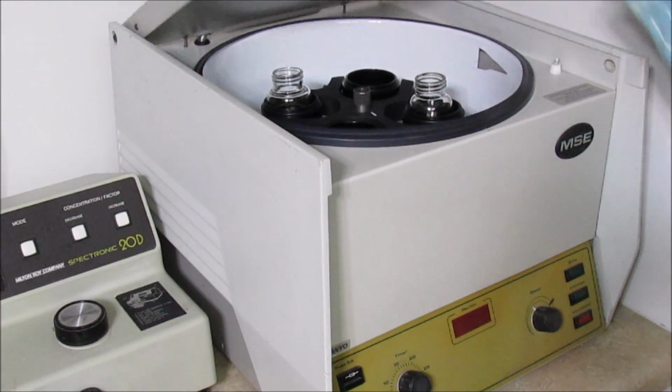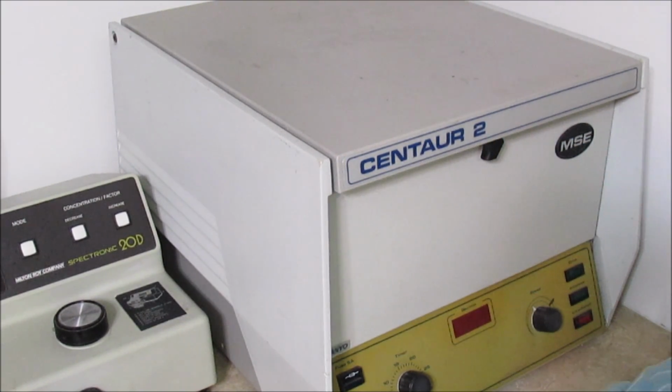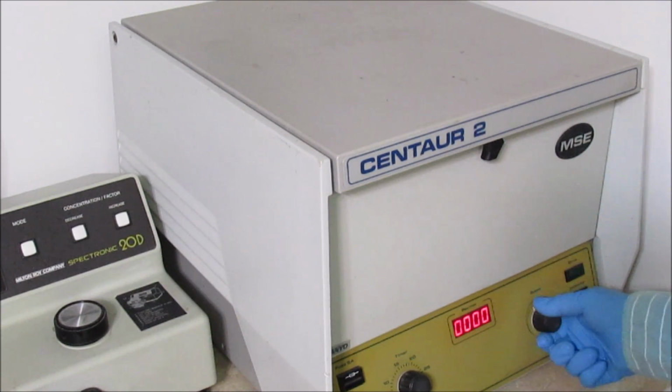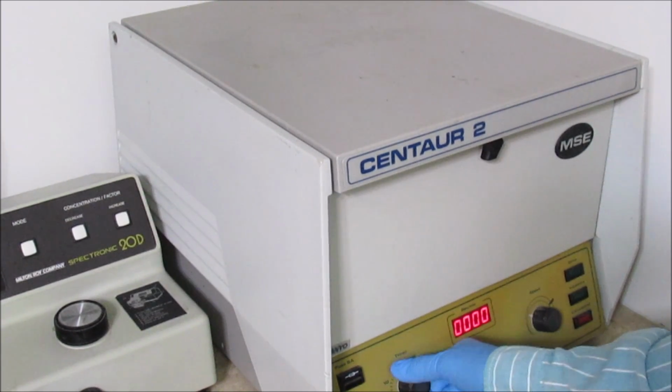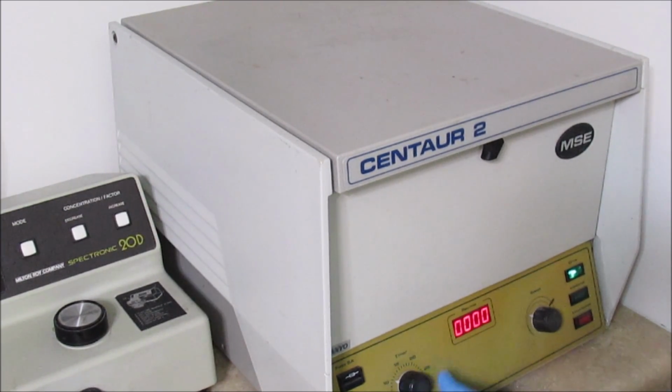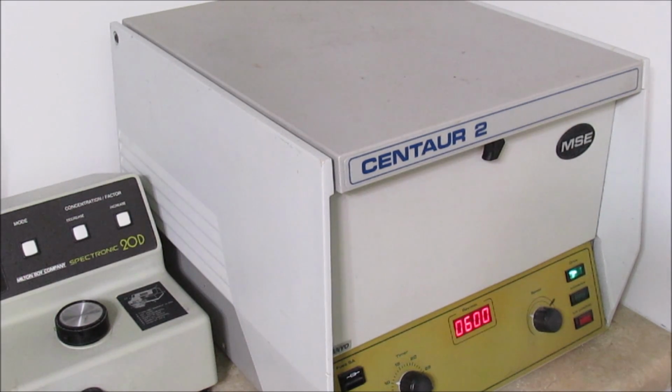Alright, we'll load our samples in here. Close the lid. Lock it. Power on. We're just going to spin this at a low RPM for about 10 minutes, I guess. 500, 600 RPM, below 1,000. Should be fine.